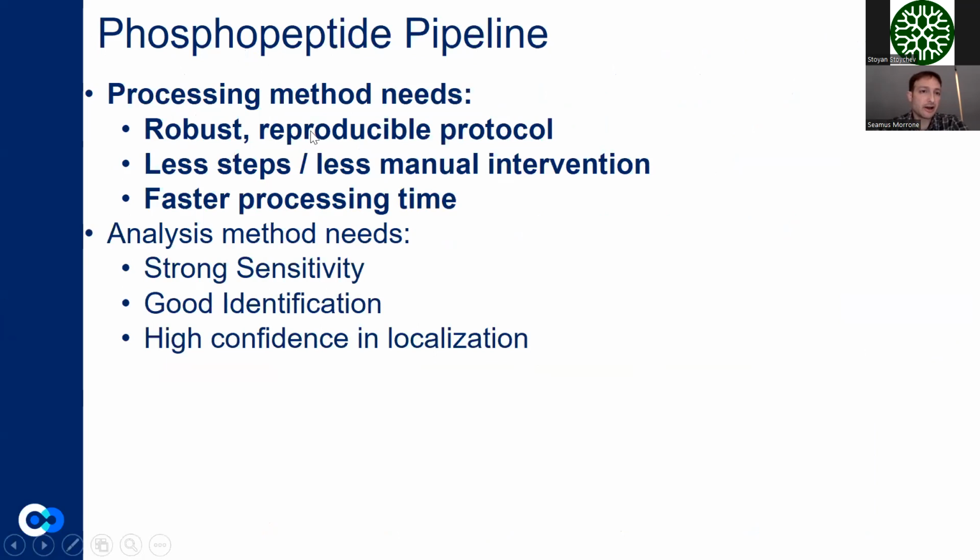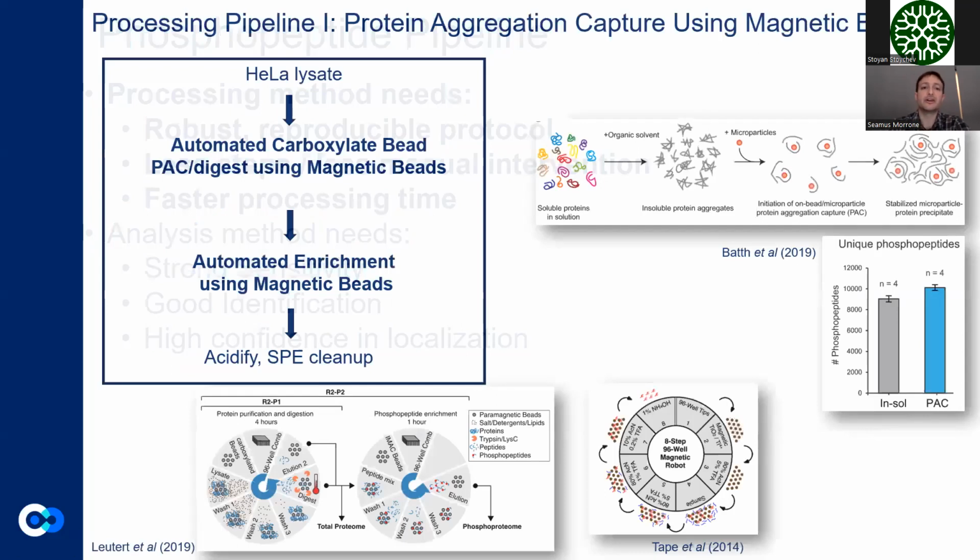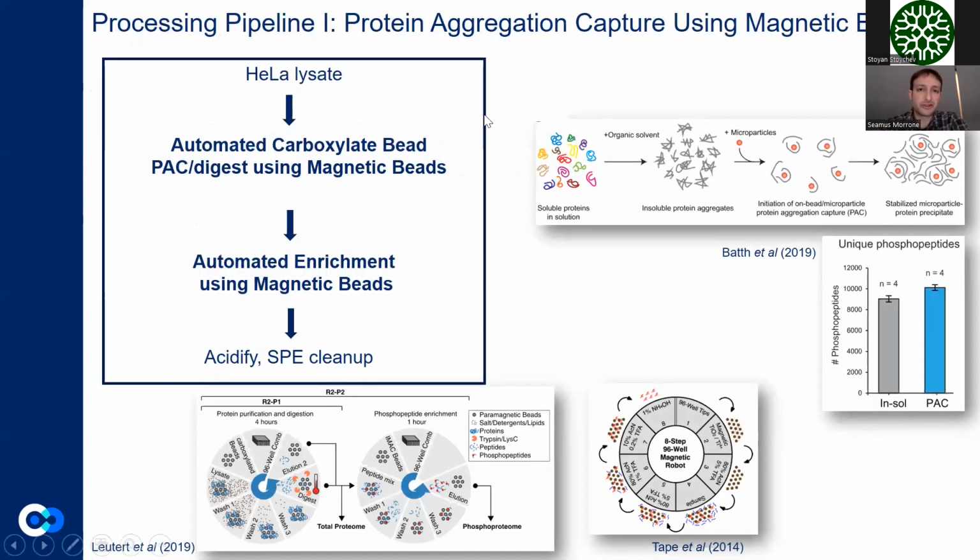So tackling how we have investigated the phosphoproteome, we started with the processing methods using a semi-automated technique. So previous talks in this meeting have mentioned or focused on the protein aggregation capture, which we have adapted in our own lab for phosphoprotein processing.